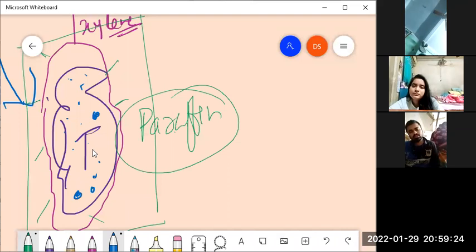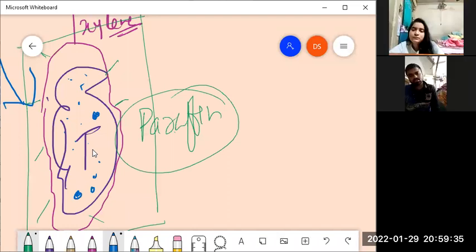Right. Now, in order to prevent this overlapping of cells in a tissue, or the extracellular matrix, that means if these are the cells, then surrounding the cells we can have spaces that I'm showing in yellow color. This can be considered as the extracellular matrix.